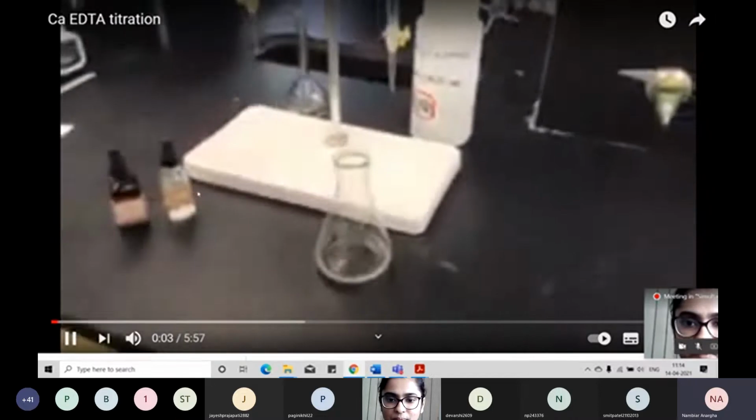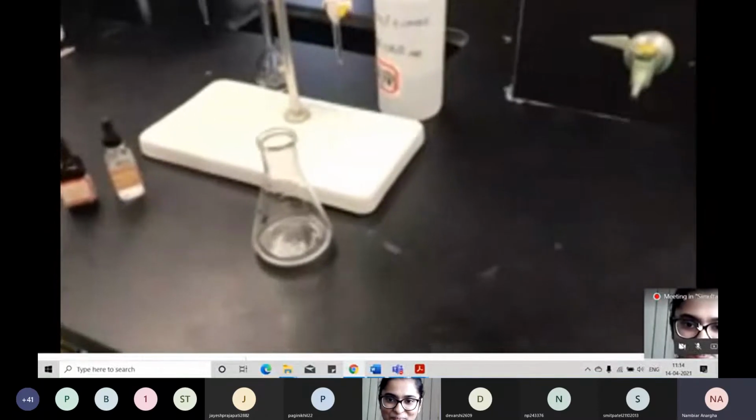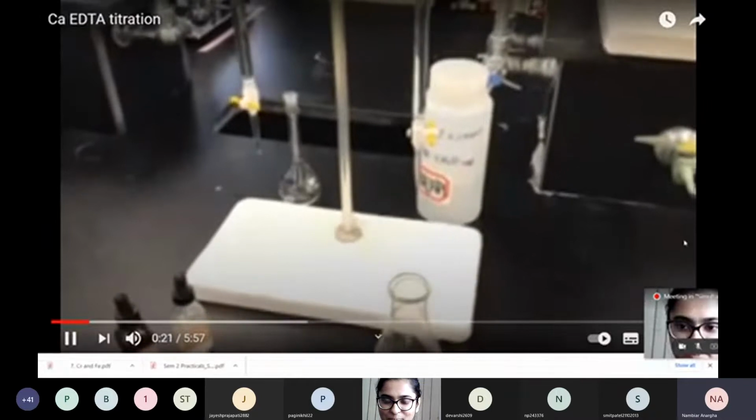Hello folks, I'm going to demonstrate here a calcium EDTA titration just like would be specified in our quantitative analysis lab. So let me quickly show you the experimental setup here. I've got a couple of burets set up here. The one on the left here contains the calcium aqueous unknown.